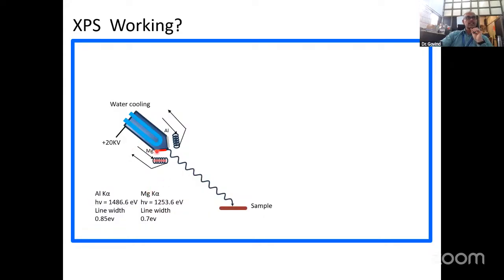Now, once the X-ray bombards the sample, what happens? For the sample, it is very important to connect it to the ground. In SEM or TEM, there is a charging effect. When you see SEM and TEM lectures, you hear "charging effect, charging effect." Here also, when we do not connect our sample, the sample gets charged.